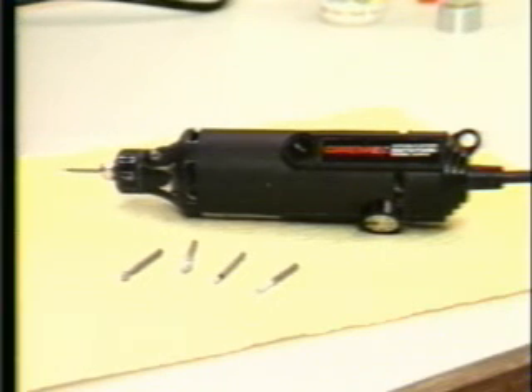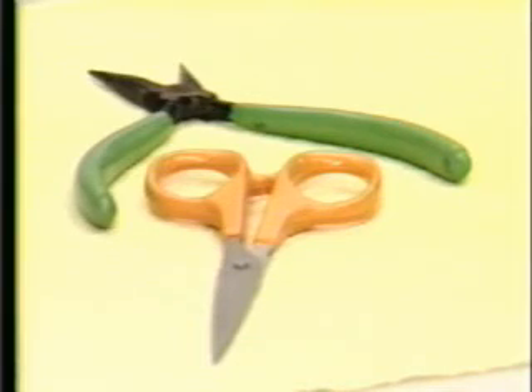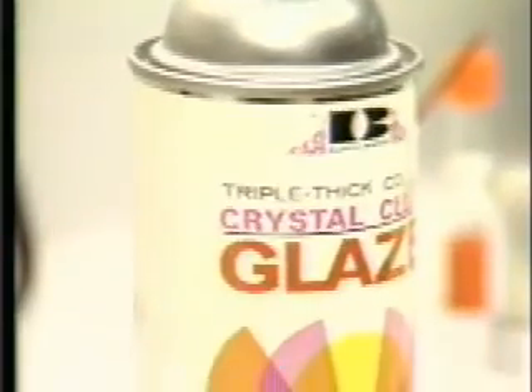Shaping tools including a Dremel-type grinding tool, files, sandpaper, and polishing materials. Needle-nosed pliers and scissors are needed. And some clear spray film is optional for polishing.